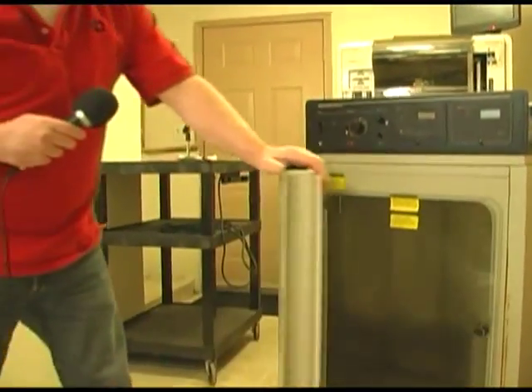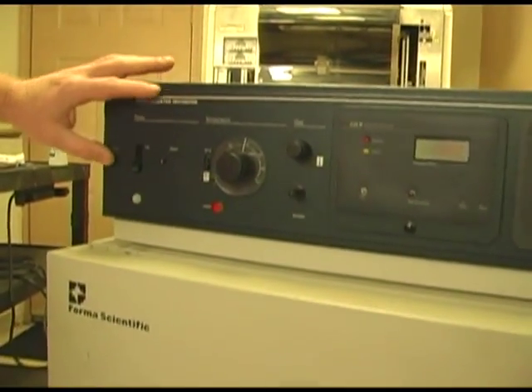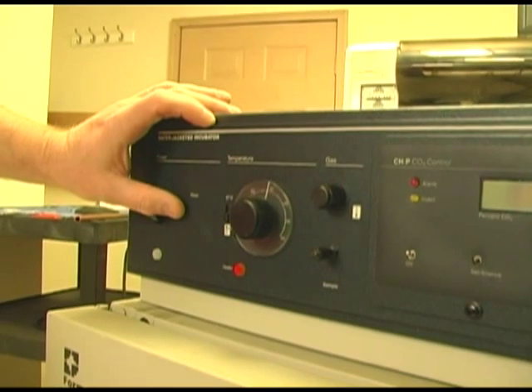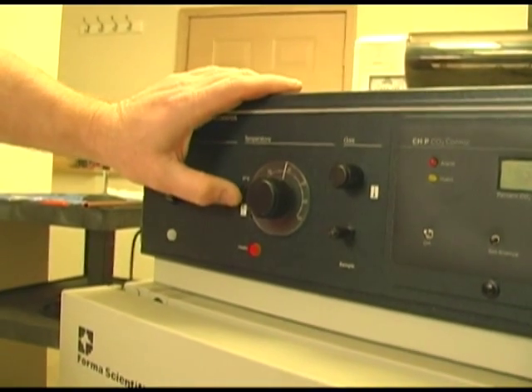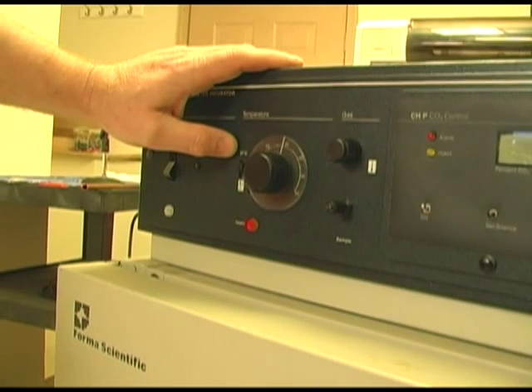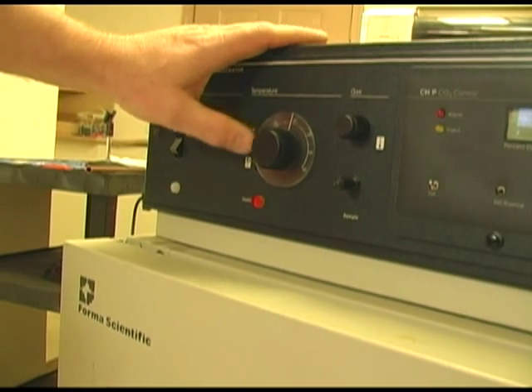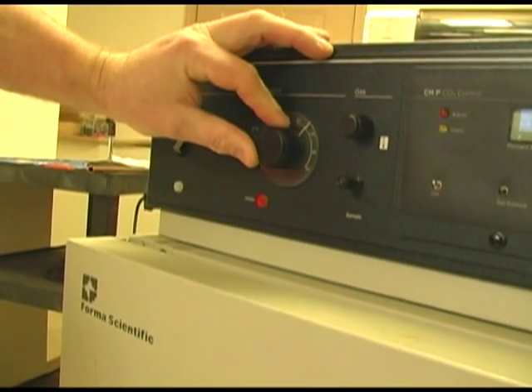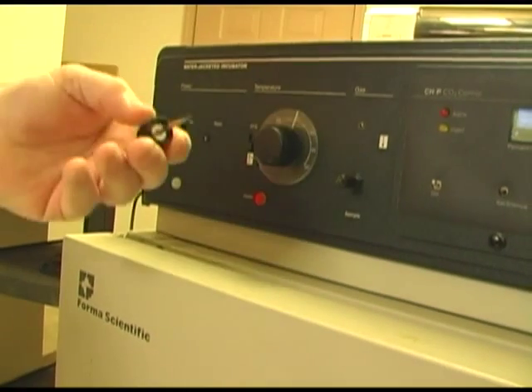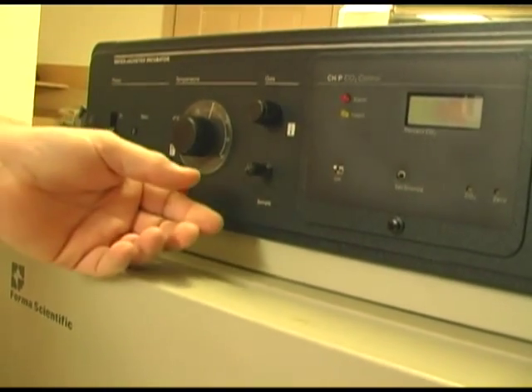Some incubators have actual controls so you can set a set point for humidity. On top, left to right, you've got the power on/off switch and a circuit breaker. This particular switch keeps the temperature at 37 degrees at all times, which is a common set point. But if you need something special, you can switch to the bottom position and use the knob to set your set point — 40 degrees or whatever. This small screwdriver adjustment allows you to do calibration and set your set points.